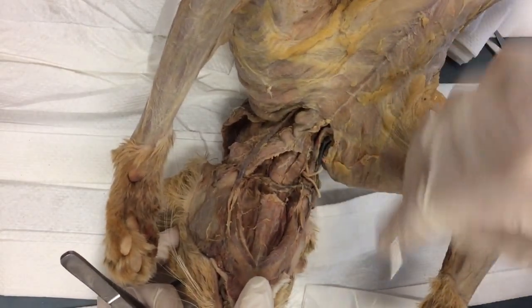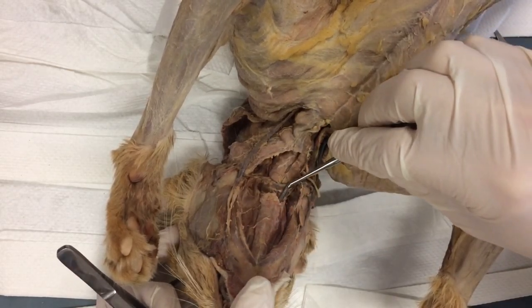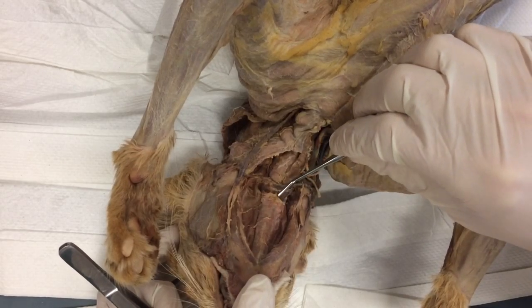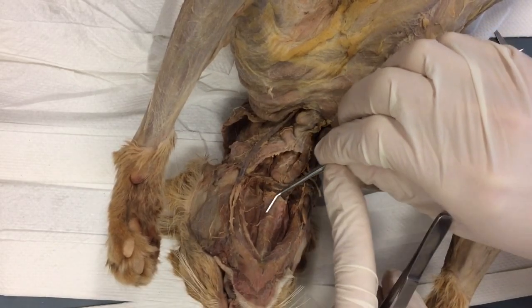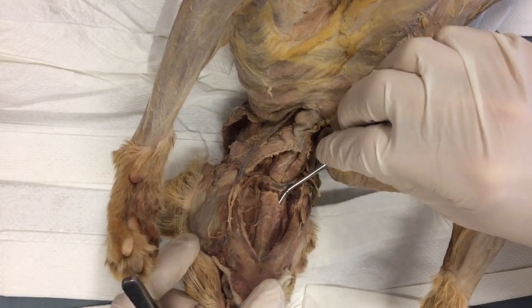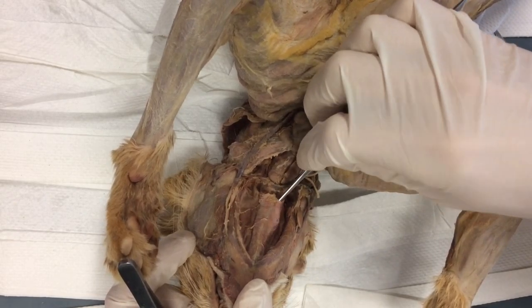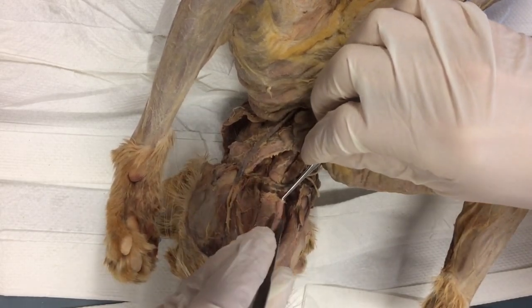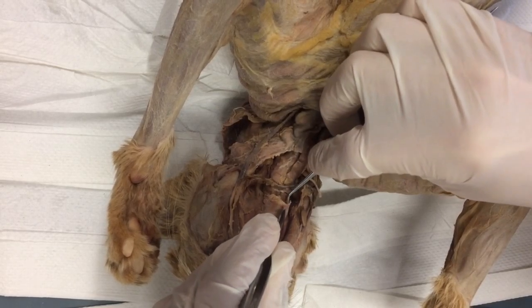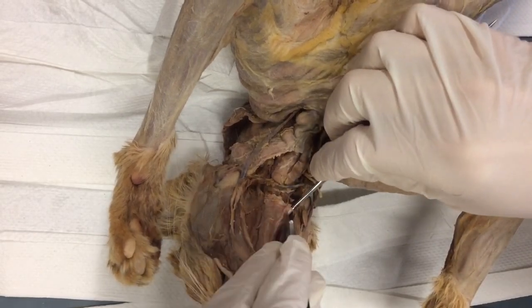Now on my side here, what I'm going to do is take my probe, watch this, and I'm just going to run it under here. This is called the nose wiggle. Nose in, and what am I doing? You're just going to roll it in your fingers a little bit, and that's just going to clear connective tissue as I move up here. See me lifting it up? That's the muscle we want. I'm going to support it right here, and then I'm just going to drag back. And you can see that muscle's freeing up.